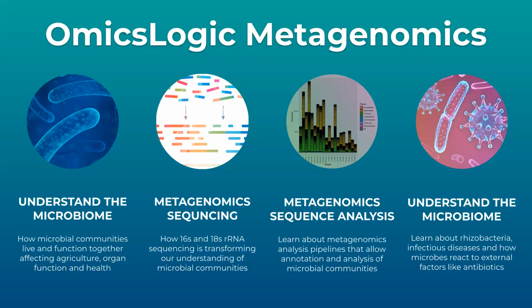And also we'll look at how we can study the taxonomy, the proportions of different types of organisms, composition of the microbiome, and be able to compare different samples. How do we understand the composition changes from condition to condition? We'll also try to understand, interpret what might that type of analysis reveal to us.